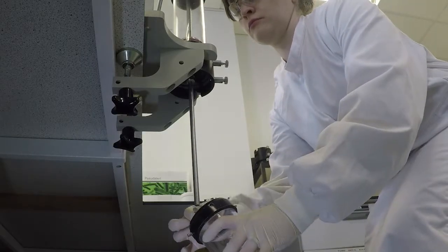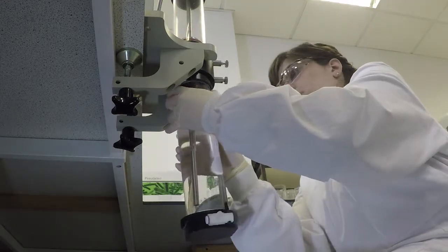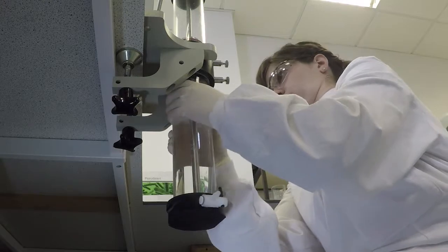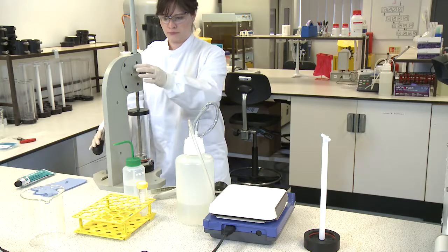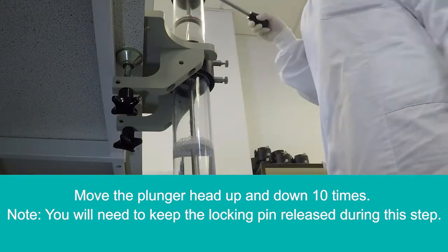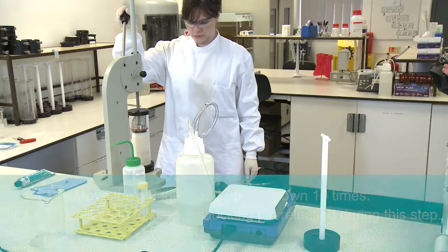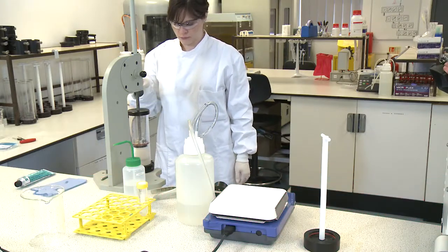Remove the rubber stopper from the steel tube and attach the assembled concentrator tube to the quick connect. Wash the filter module by moving the plunger head fully up and down 10 times. Remember to move it very smoothly to avoid generating excess foam.